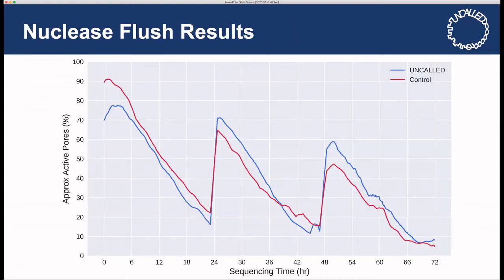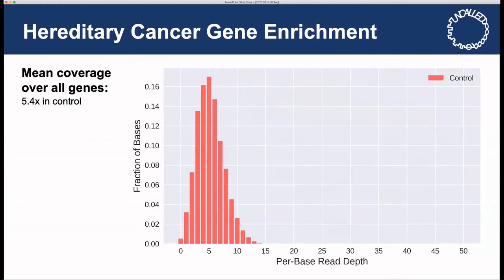So we did this. One thing that you really have to pay attention to is that with MinION sequencing, and also PromethION sequencing, your active pores decrease over time. They get clogged, they get stuck, they get fried out. But there's a protocol where you can flush the pores using a nuclease that chews up any DNA that's in there, and reload them. This restores the activity of the pores so that you can then get good yields coming out on the back end. So doing this for real, in an experimental way, we did it side-by-side from the same sample of DNA.